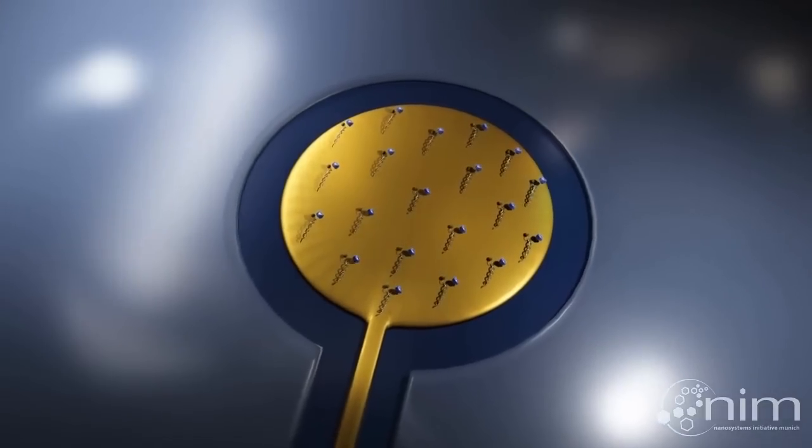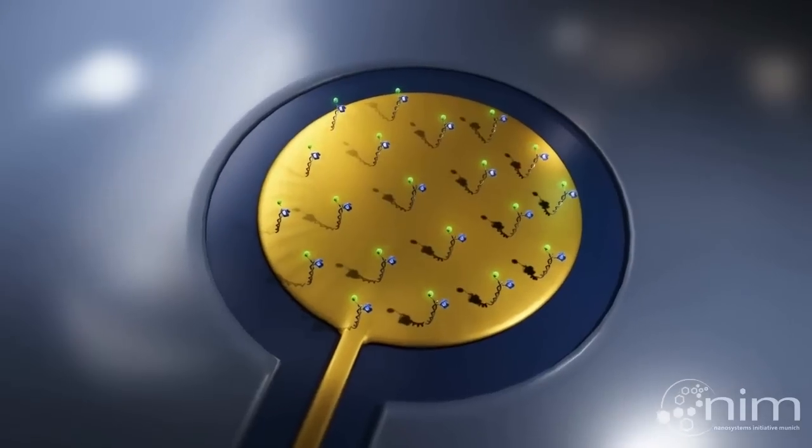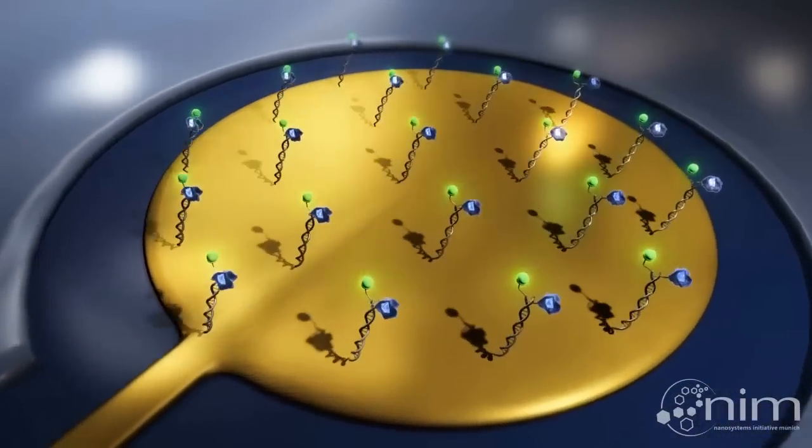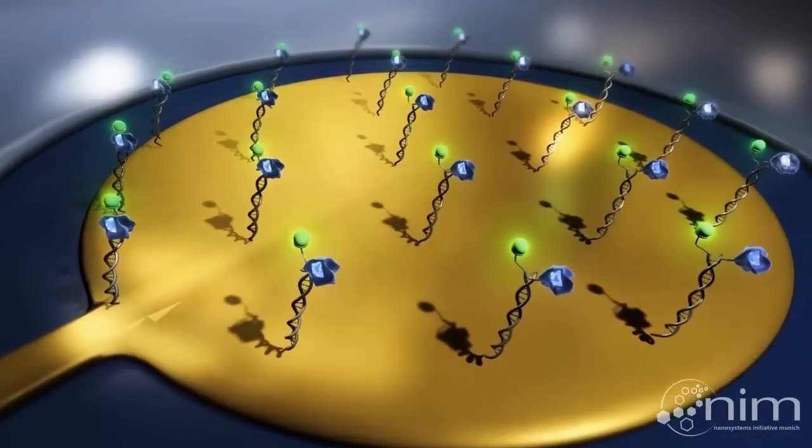As the SwitchSense analyzer applies alternating voltages to the electrode, the negatively charged DNA is repeatedly attracted to and repelled from the surface.